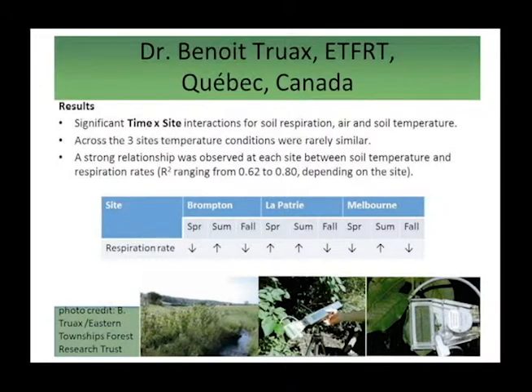measurements in late May. In the images at the bottom, you can see the handheld photosynthesis system. The leaf chamber is installed here on the tripod using the tripod mount, and as well an example of some of their field sites.